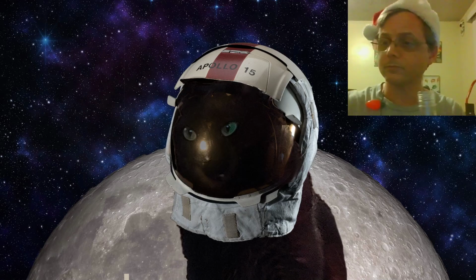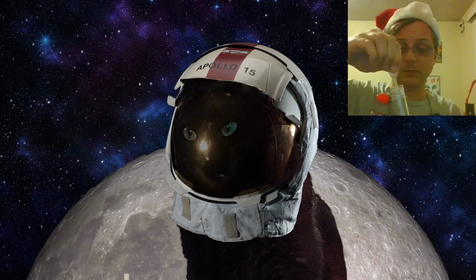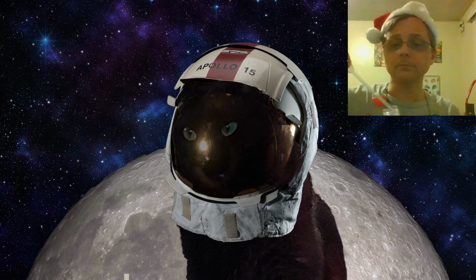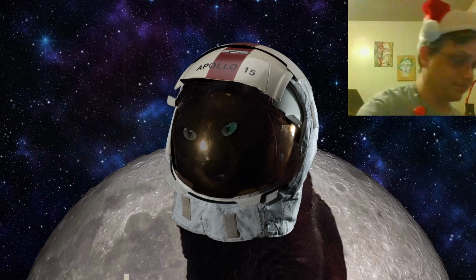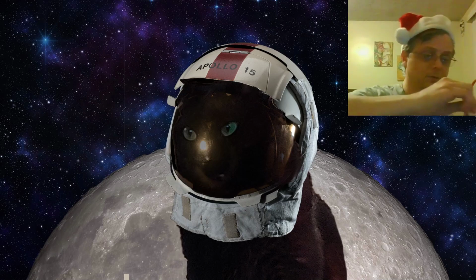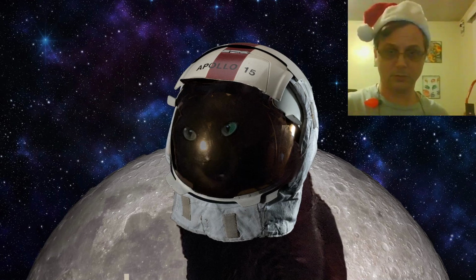So let's see if I can get any of it. There's a lot of big chunks in here. We'll see. 1, 2, 3, 4, 5, 6. 6 drops.